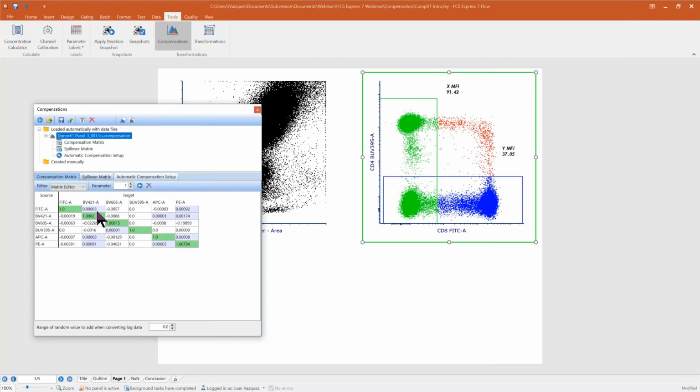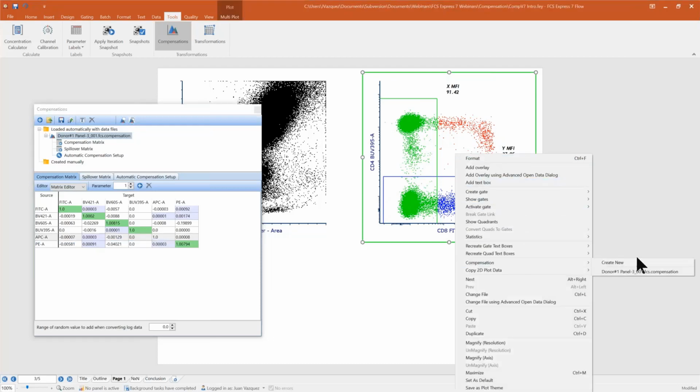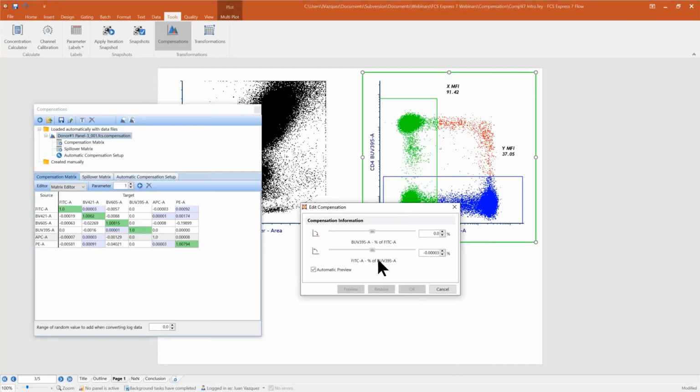Okay. So you can actually click in these cells to tweak your data as well, and this all happens live. But you can also see that if I simply tweaked it here, you can actually see these numbers change within the matrices. Okay, and you also notice that these matrices have a heat map effect to them, where we can actually see coloring based off of any of the high values or any of the low values and any shading in between.